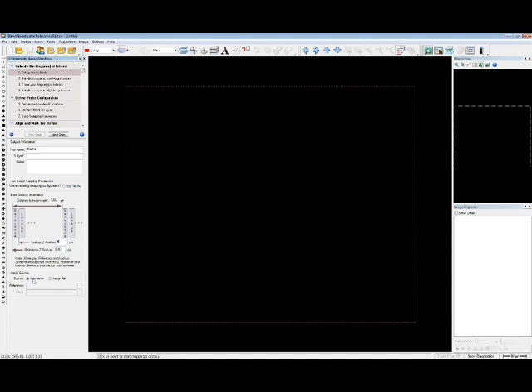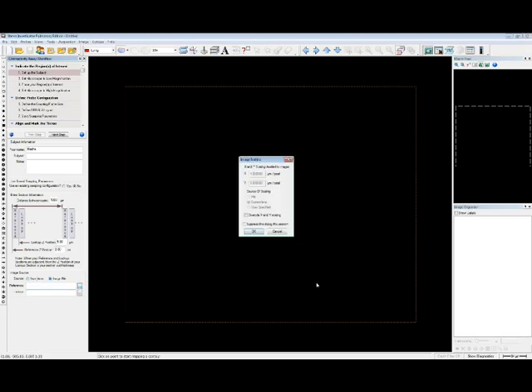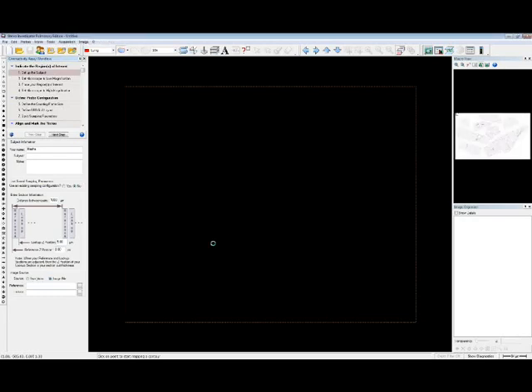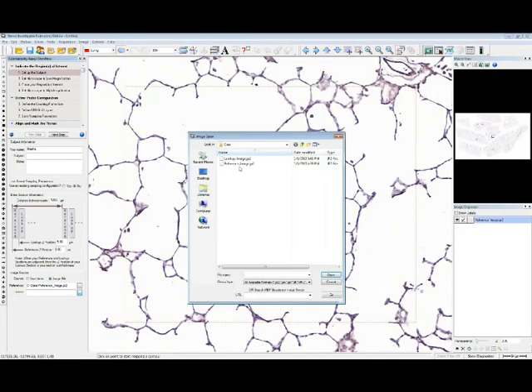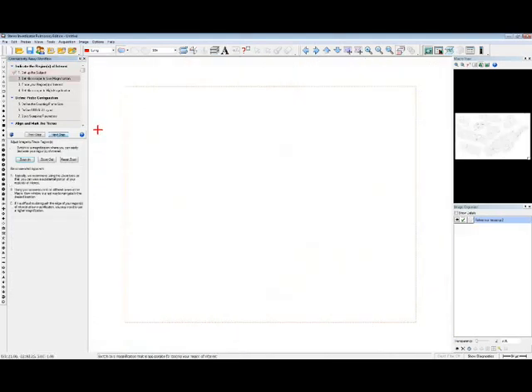We can also choose the image source. We could go from live video or from an image file, which is what we're going to use here. I can upload our reference images that we collected before, and I will also upload our lookup. And we'll proceed to the next step.